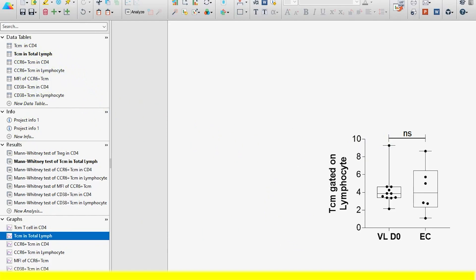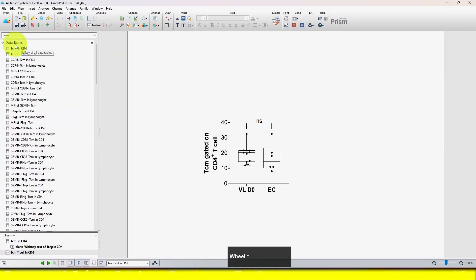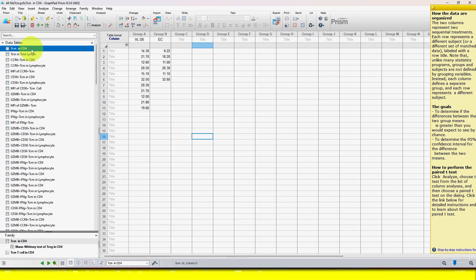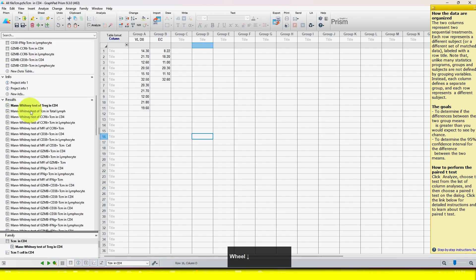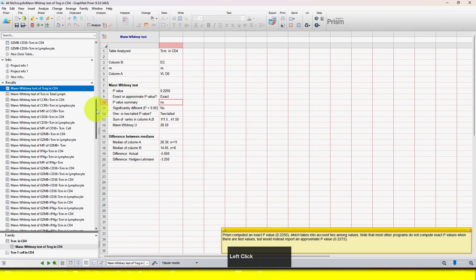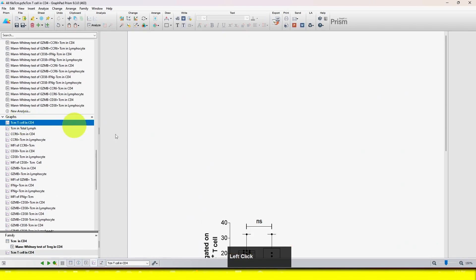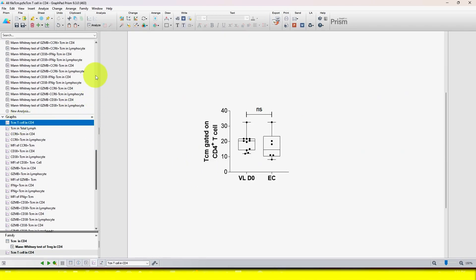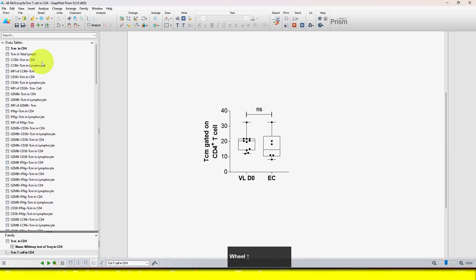But now I'm going to show you another file. Here you can see I have multiple data files. If you select data table file one here, you will not be able to see the result file associated with that data file without scrolling down. And if you click, then you can see the result, but you have to further scroll down to see the graph file.